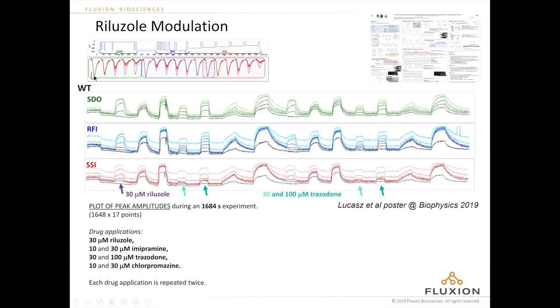The black one is the first step, and the light green one is the last one. And these are the gradients for these steps here. As they're being plotted on top of each other, you can see the drugs going in and out.